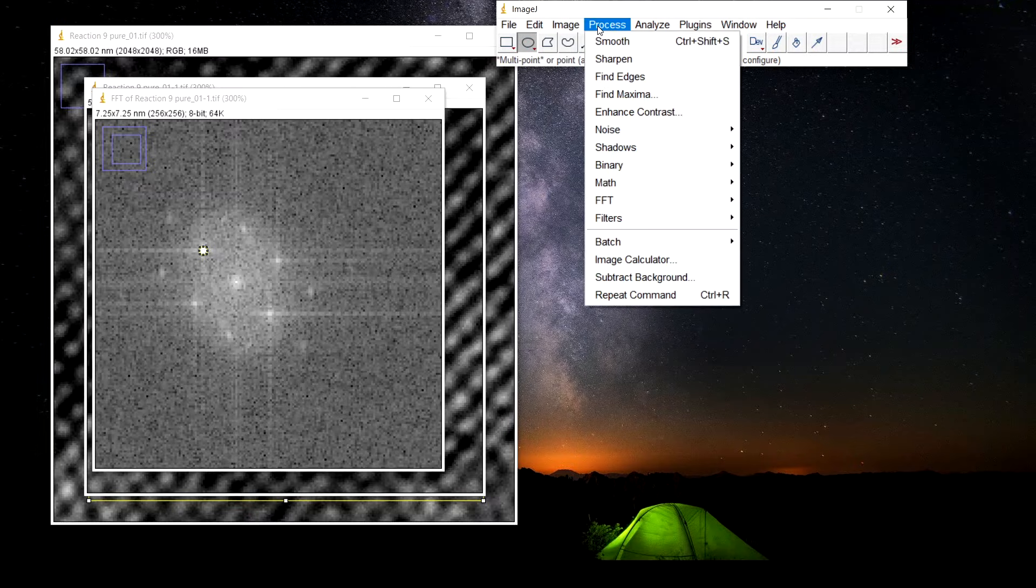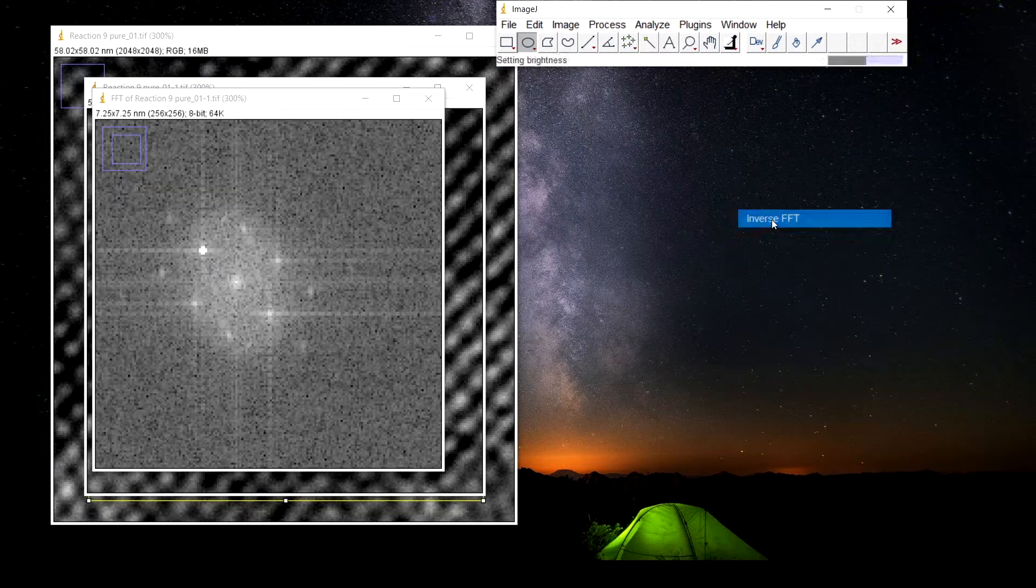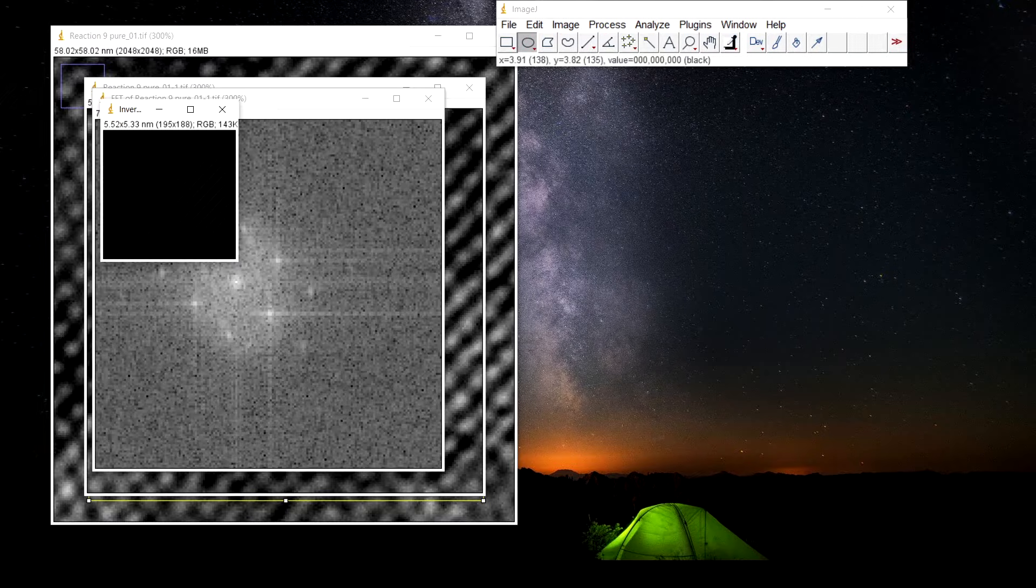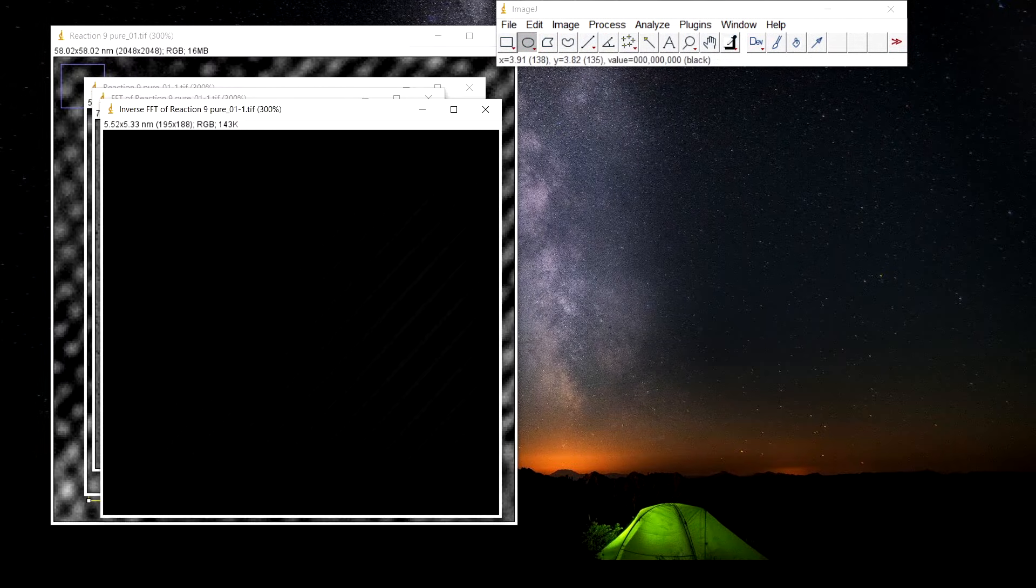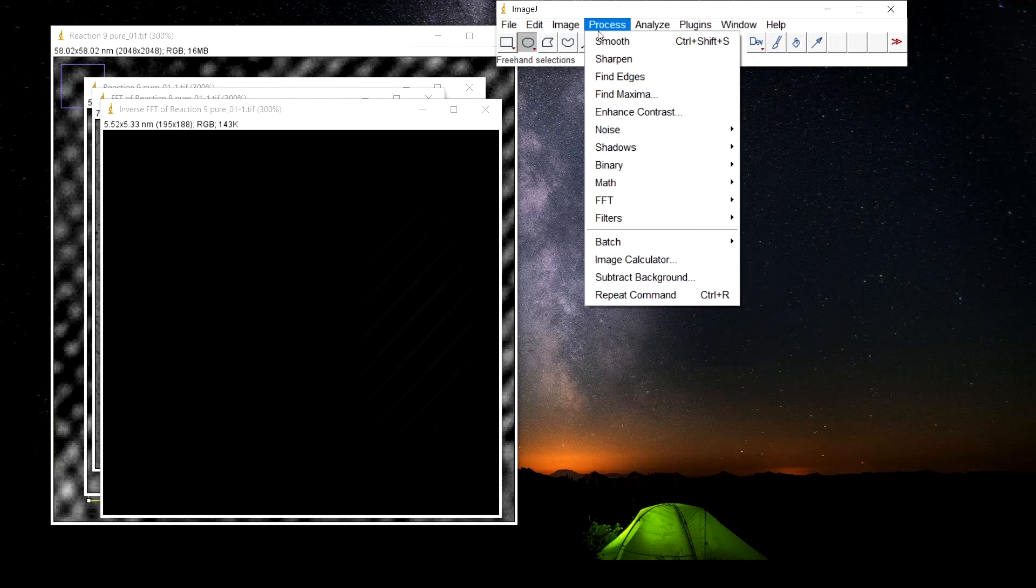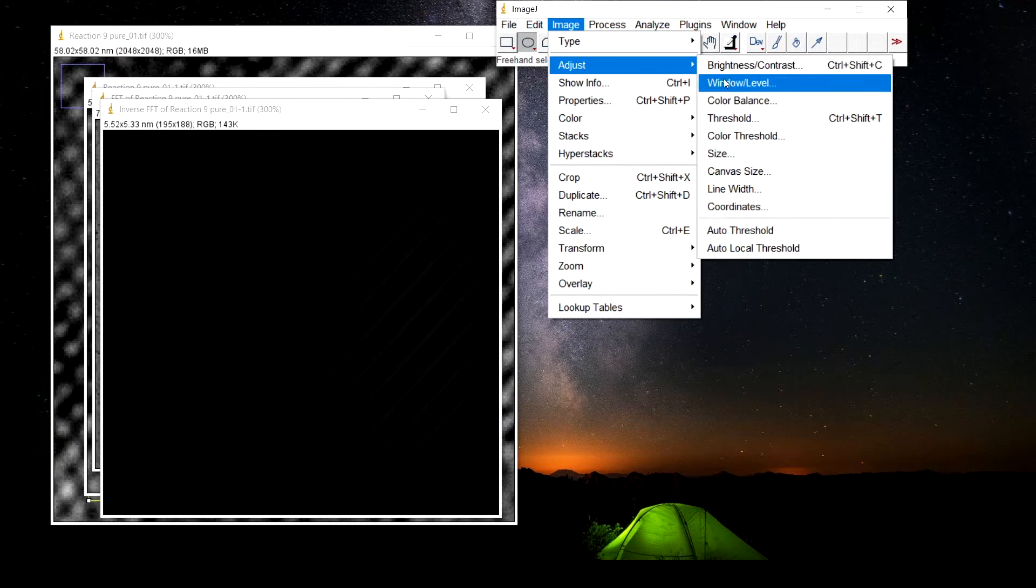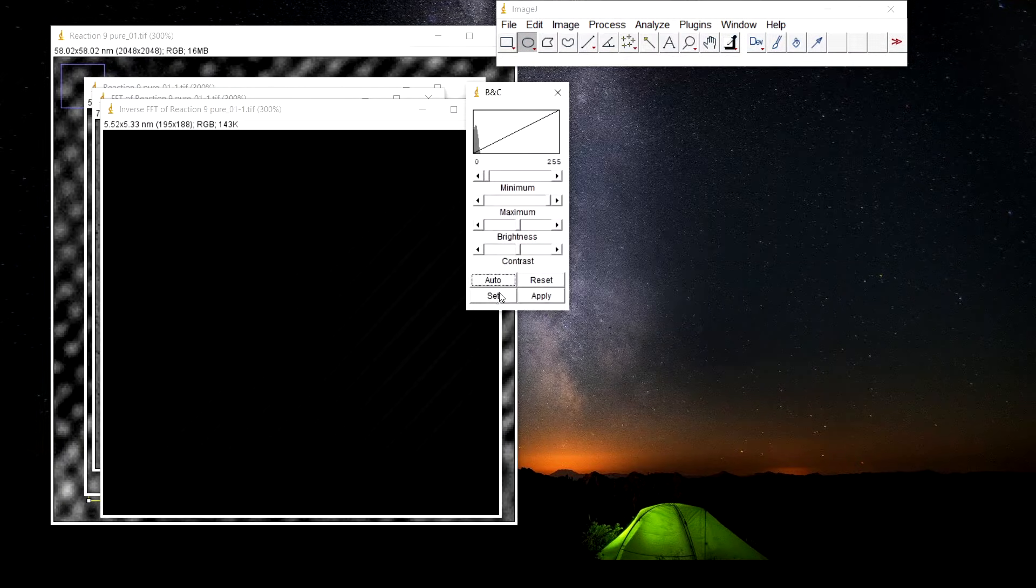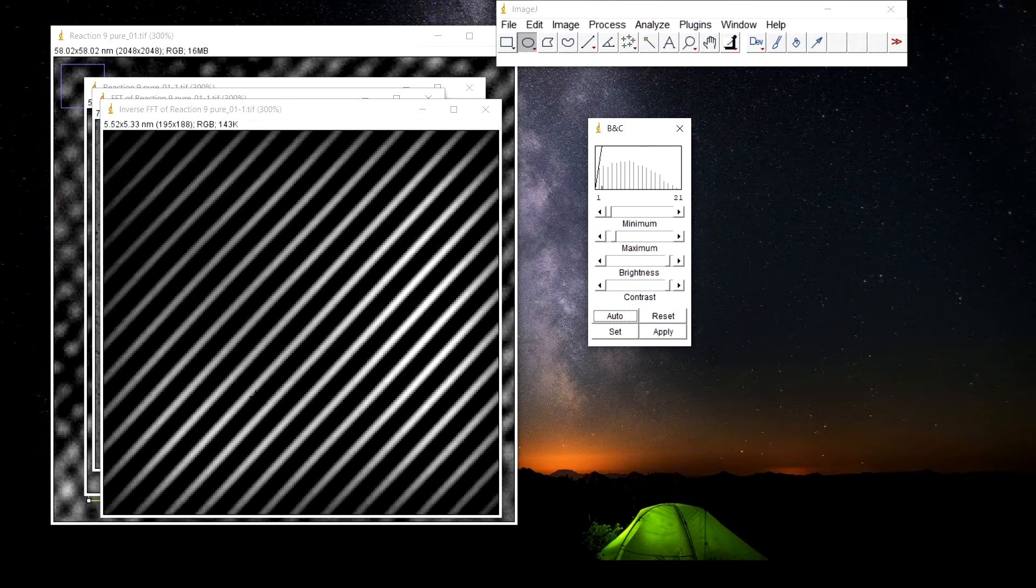Now go to process, FFT, and inverse FFT. Here, now go to image adjust, brightness contrast, press auto so that we can see the image.